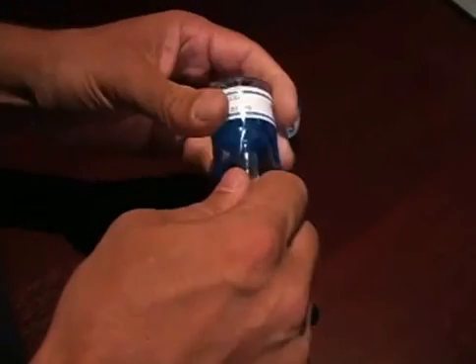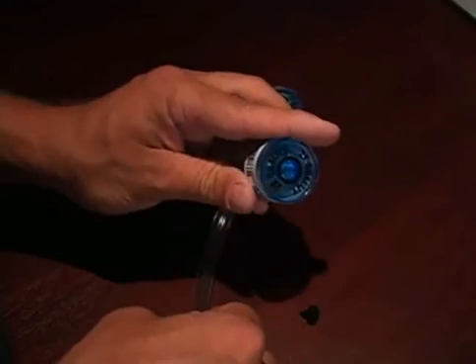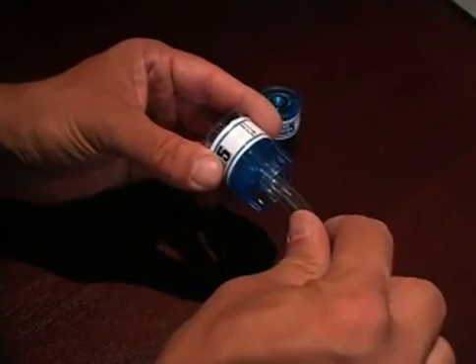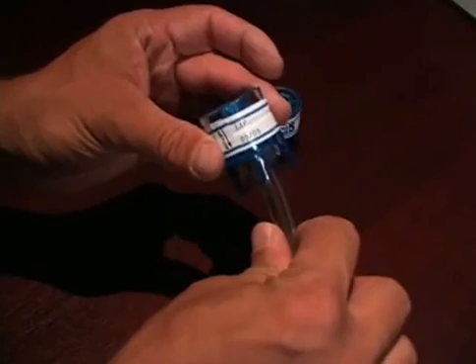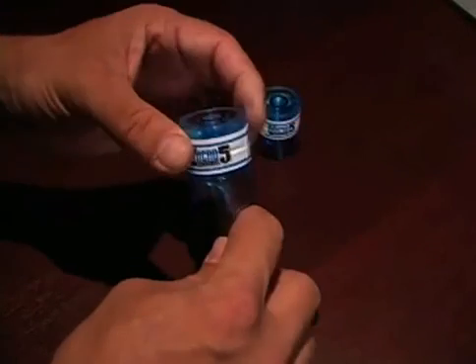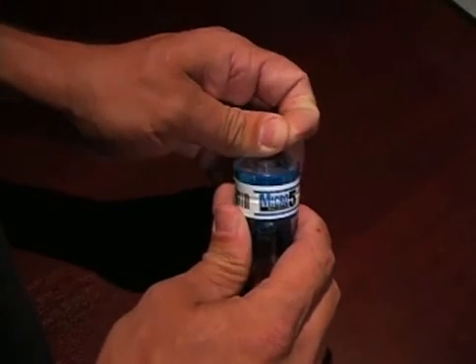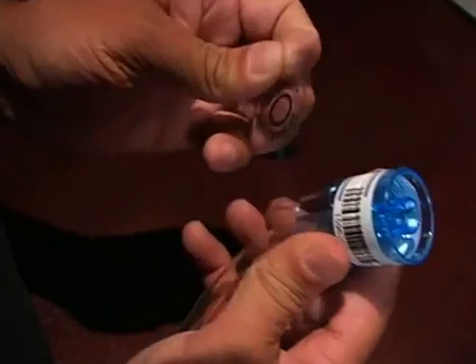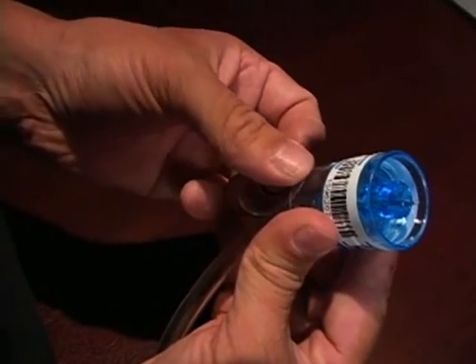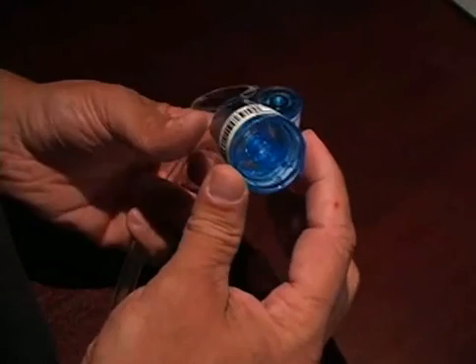It's in your tripod at breathing height, about 5 feet, 3 to 6 feet. And it's in your location where you're going to sample. You're going to sample it according to the protocols. You peel back this sticky quality sticker here. I like to put it on the edge behind. Now you're ready to go. This is the airflow direction. It's going to go in to the impaction, coming out through the tube to your pump.